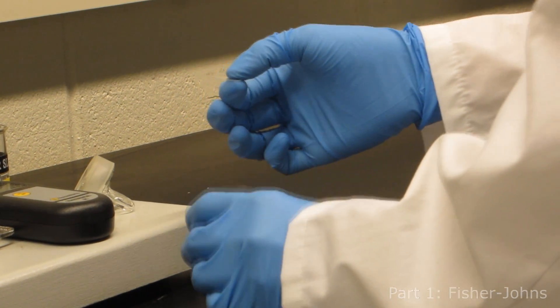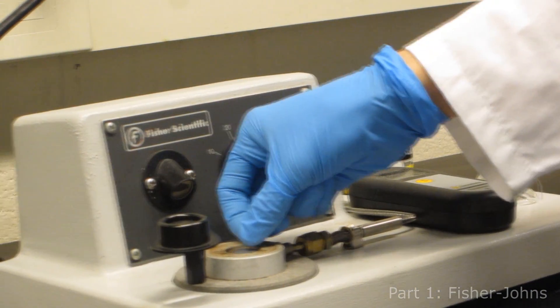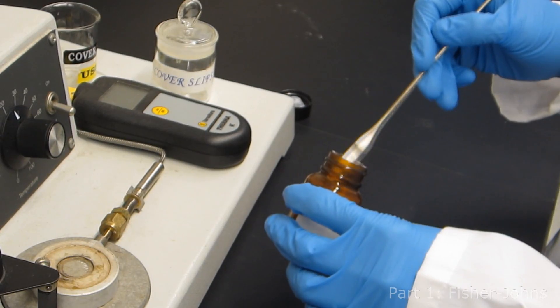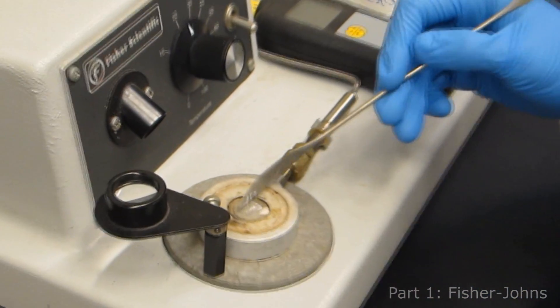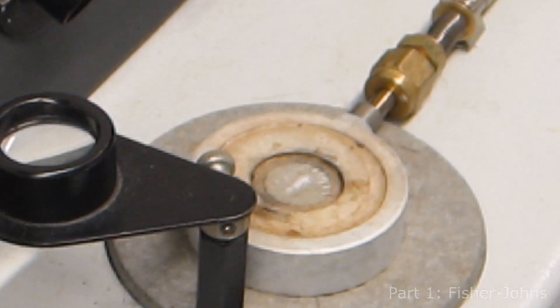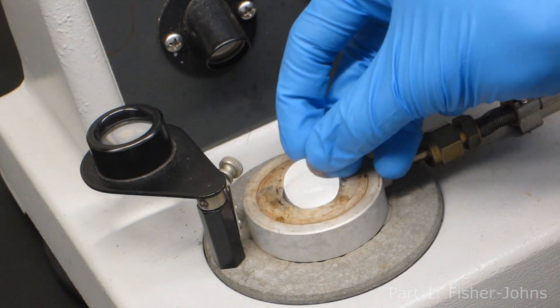Carefully place a round glass cover slide into the well of the hot stage, then carefully place a few crystals on the glass. If too much sample is placed on the glass, it will take longer to melt and artificially increase the melting range, making it inaccurate. Once you have placed an appropriate amount of sample on the first glass cover slide, place a second one on top to sandwich the crystals.